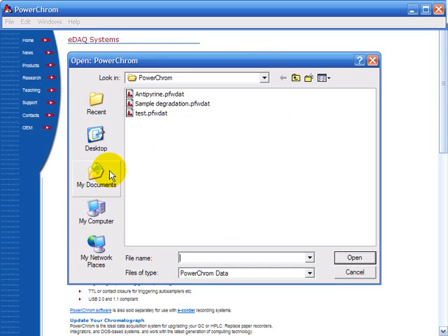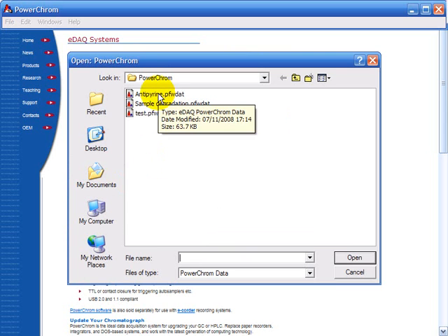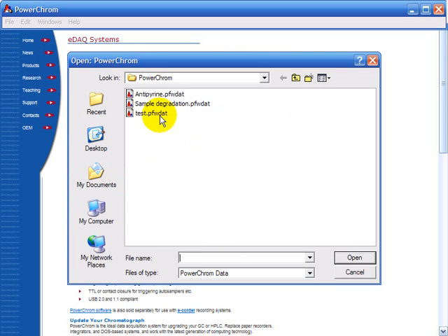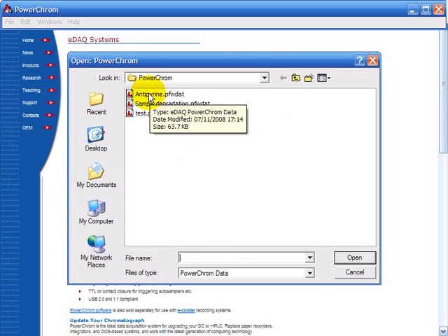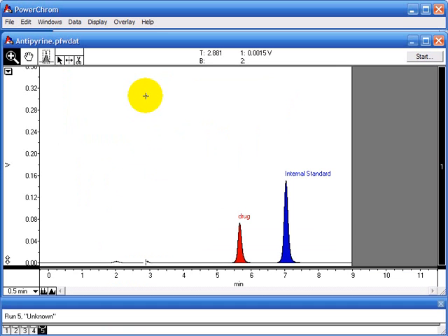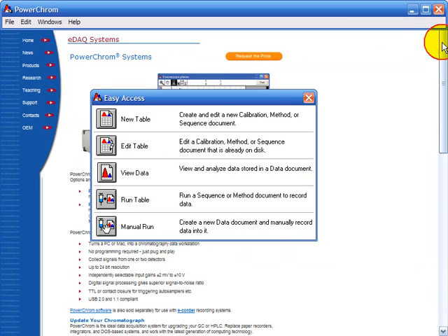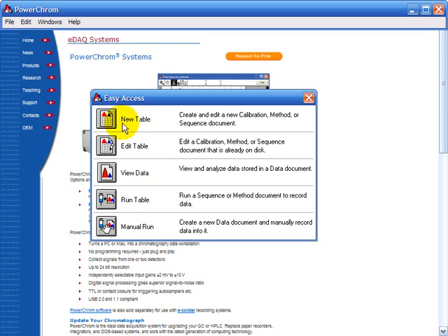If you click view data it lets you view data you've collected before. This one for example. Run table lets you run tables that you've made up here.